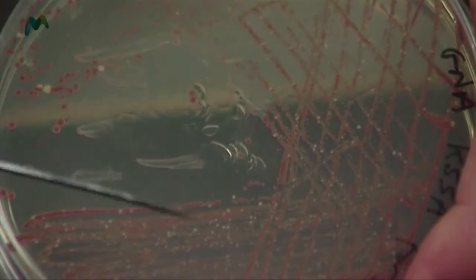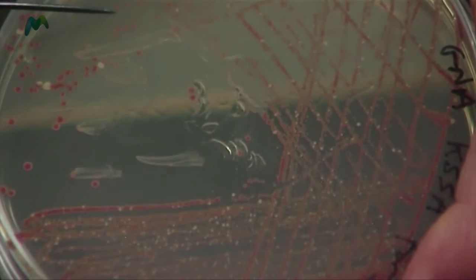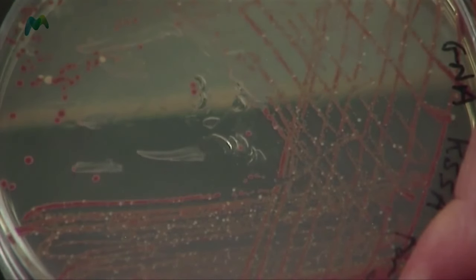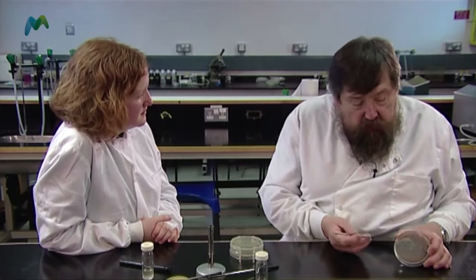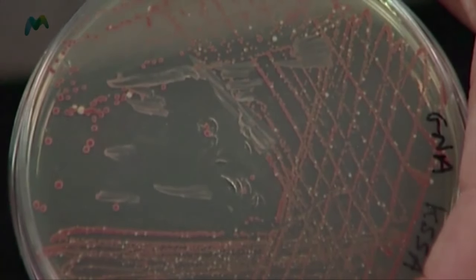With this plate, where I've streaked this culture out, you can see the culture is red — but there's a problem. If you look very closely, you can see in between the red colonies some white colonies. These white colonies have developed from a single cell, and that single cell is a contaminant, so we've got a problem. If we want to keep the red culture, we would have to select only the pure red colonies and grow them on, otherwise we might transfer the contaminant into the culture we want to keep.